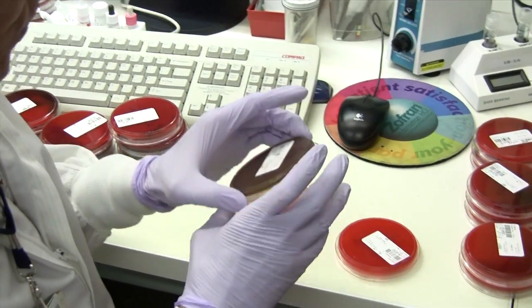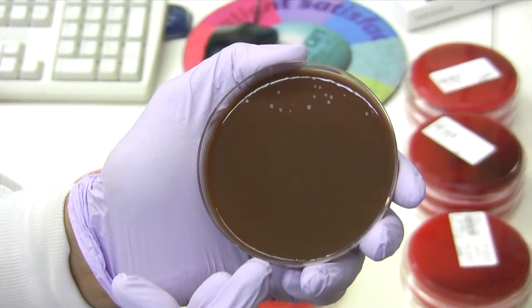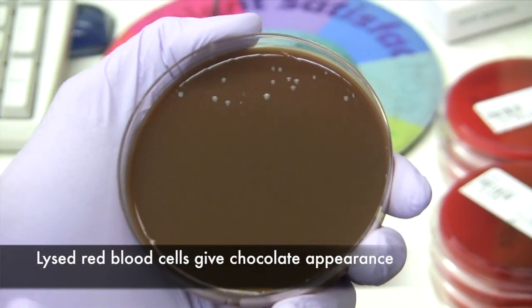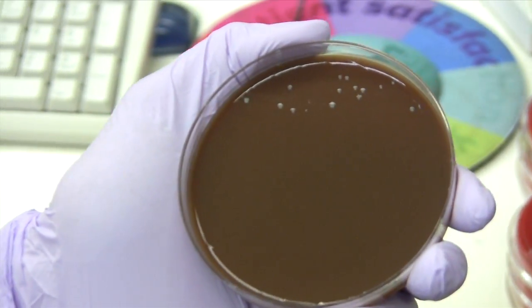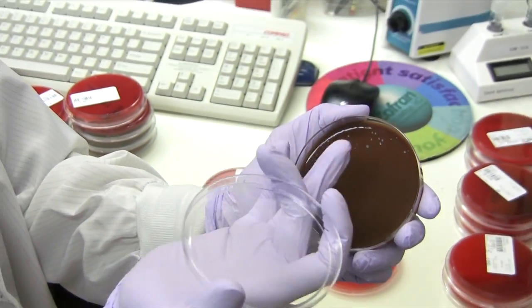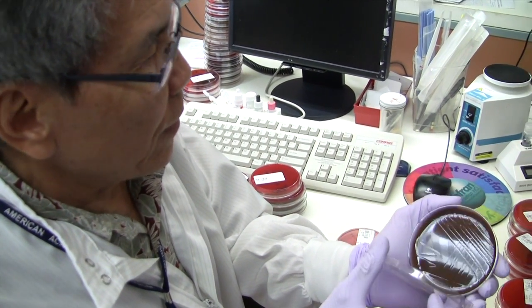The next one that we're using is the chocolate agar. When you lyse the RBC, it becomes chocolate. It provides the X and V factor for supporting the growth of Haemophilus. And this is staph aureus growing on chocolate agar.